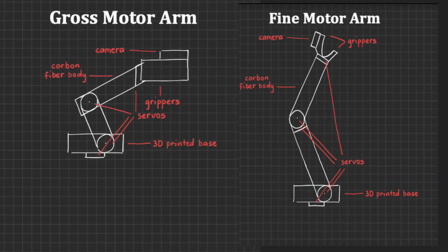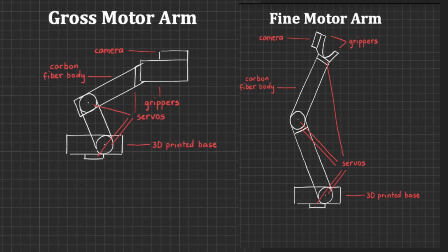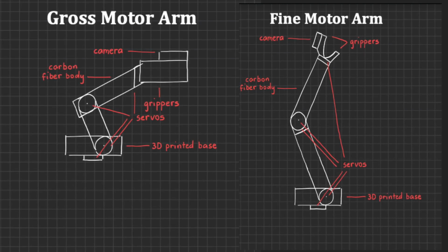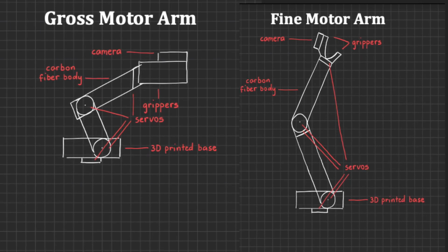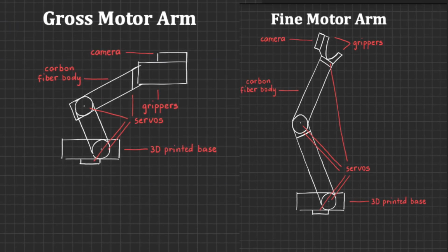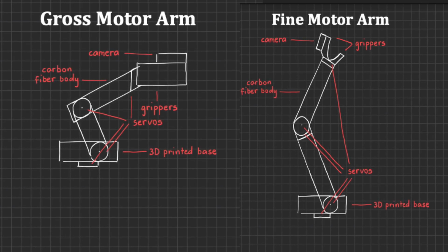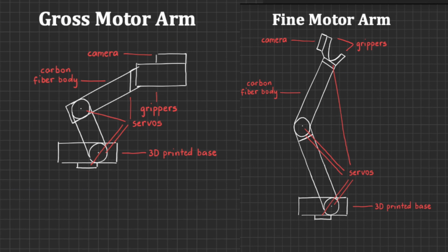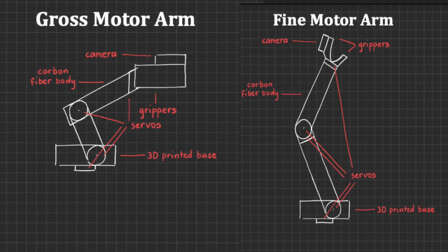Although this dual arm system was valid, we believed there was more potential, so we implemented two specialized types of arms into the payload system and thus reached our final prototype of having a larger gross arm along with a smaller finer arm. The larger arm is used for manipulating larger objects, capable of moving at higher speeds when performing actions such as mixing solutions. The other arm is a smaller arm specialized for finer movements such as accurately pouring solutions.